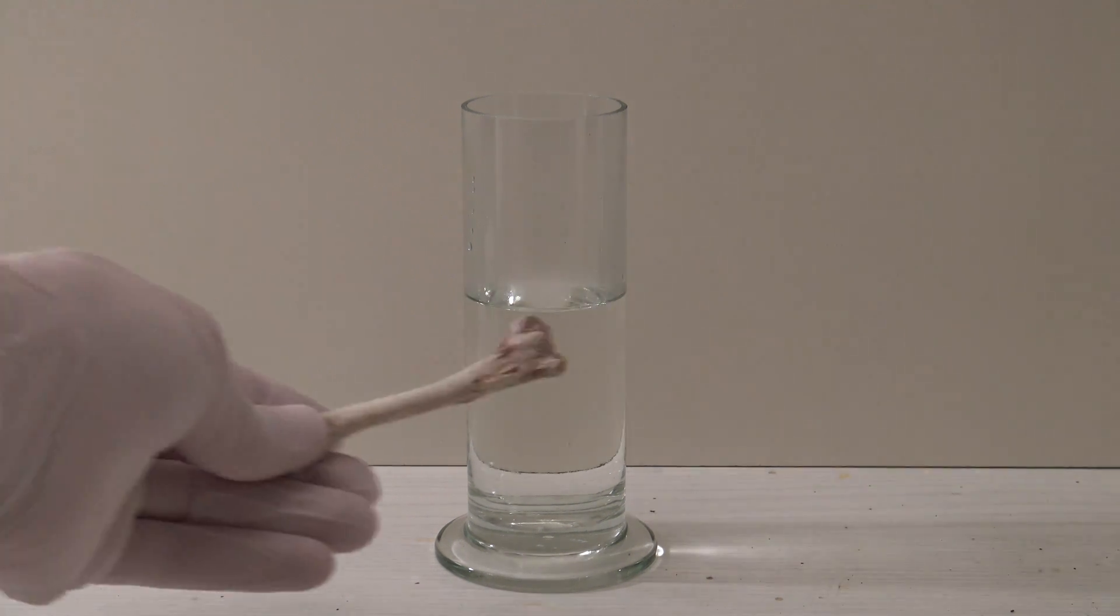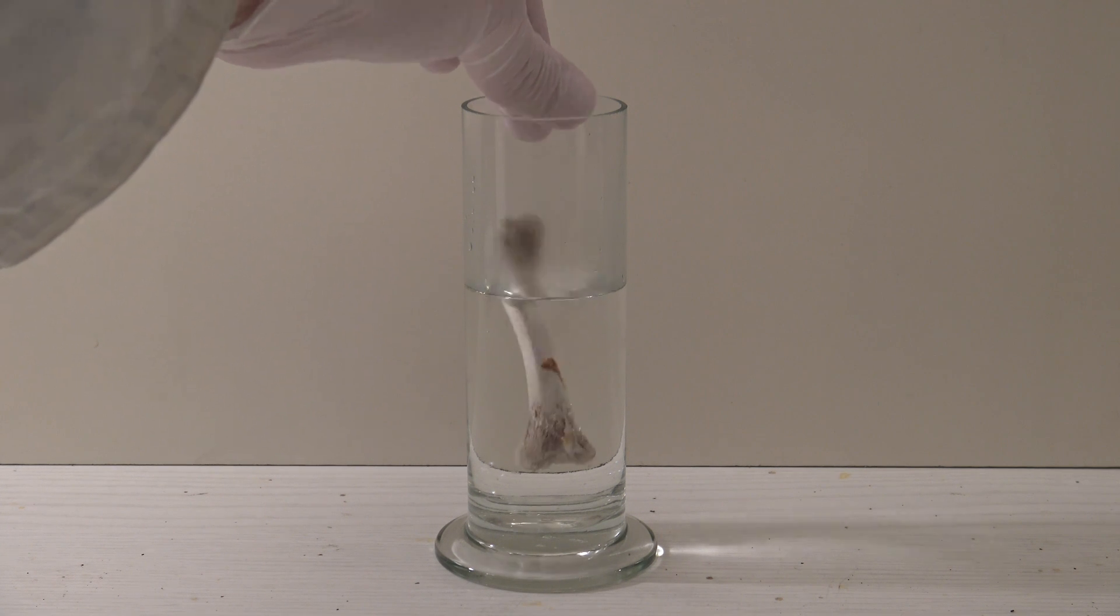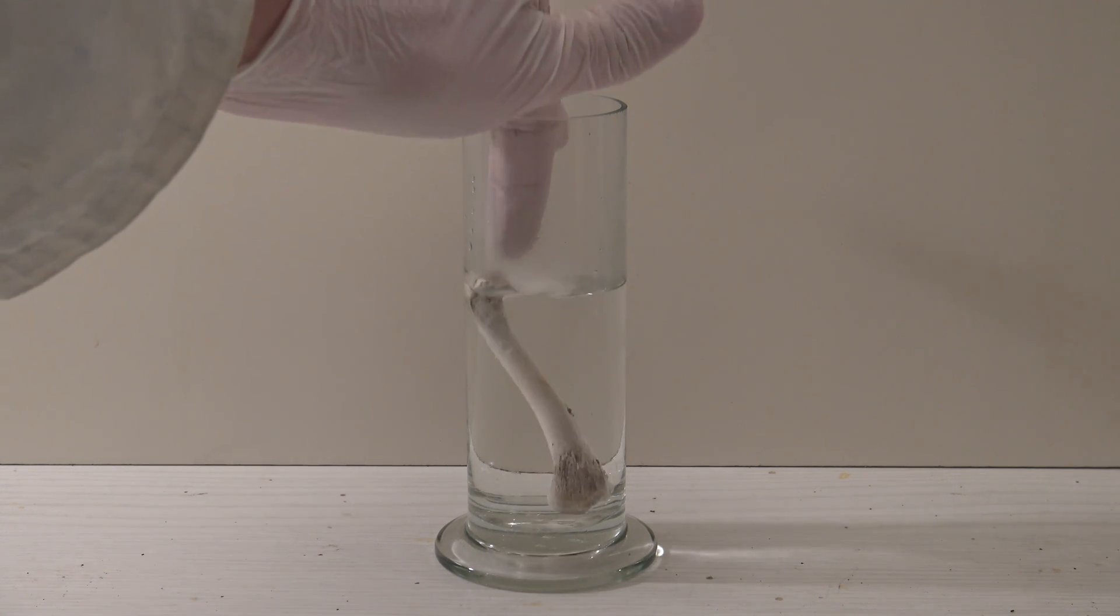Next a chicken bone was added to the acid. As it can be seen it floats because it was dried before and the bones from birds do contain air pockets.